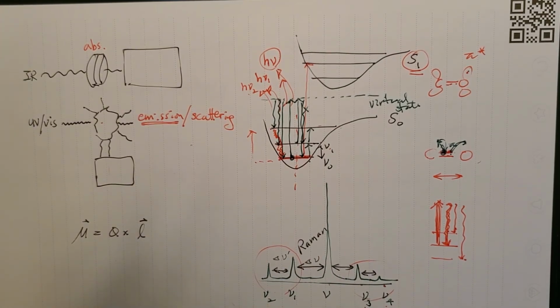However, here you are moving electrons. The movement of the electron has to do with the whole area where the electron is in the molecule. So it has to do with the molecular orbital. As you move an electron from one molecular orbital, you are moving electron density in a certain area of the molecule instead of an x, y, z linear component.